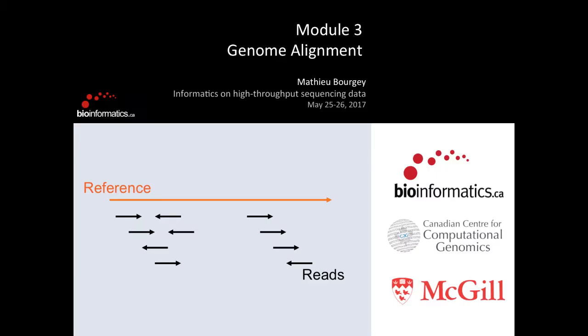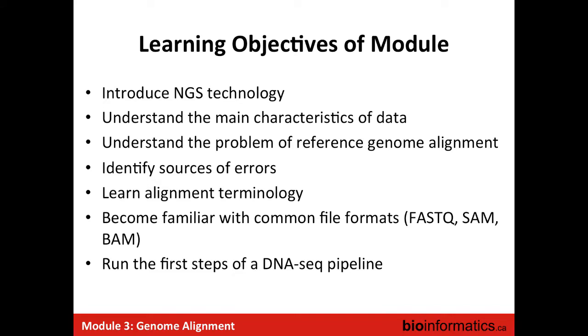This afternoon, I will talk about genome alignment. And what I want to teach you today is a bit of NGS technology, but you already had a raw introduction this morning, so perhaps I will just go fast on this part.